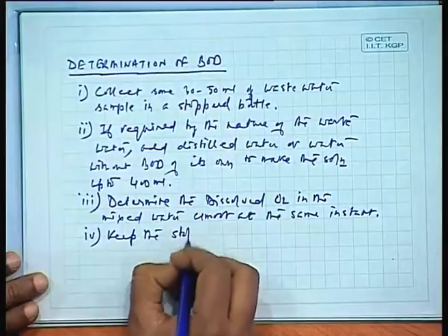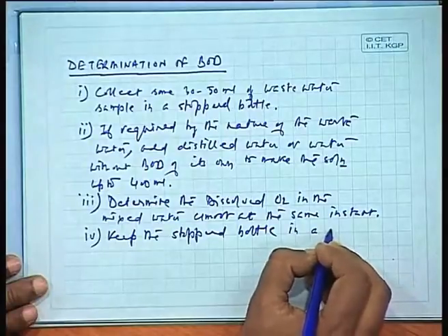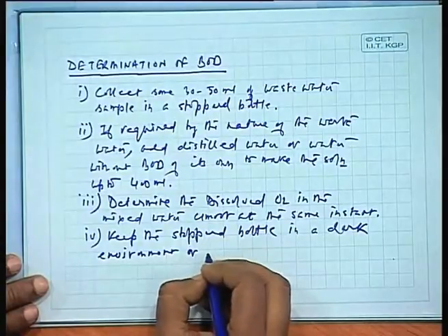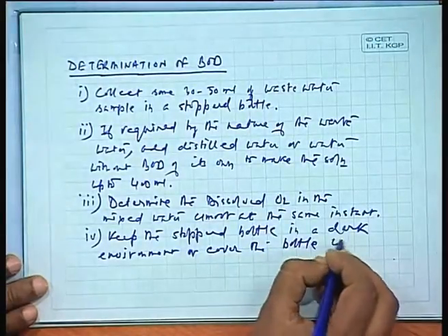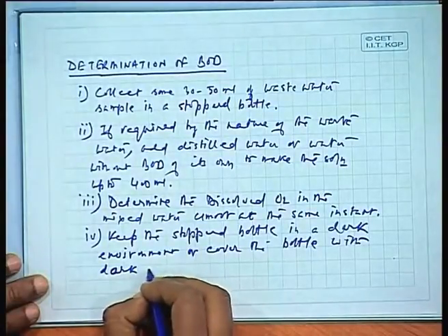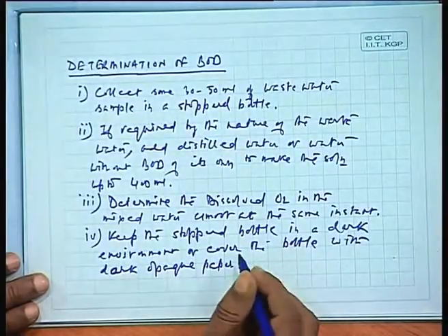Keep the stoppered bottle in a dark environment, or cover the bottle with dark opaque paper, right? Opaque paper. Why is it done?